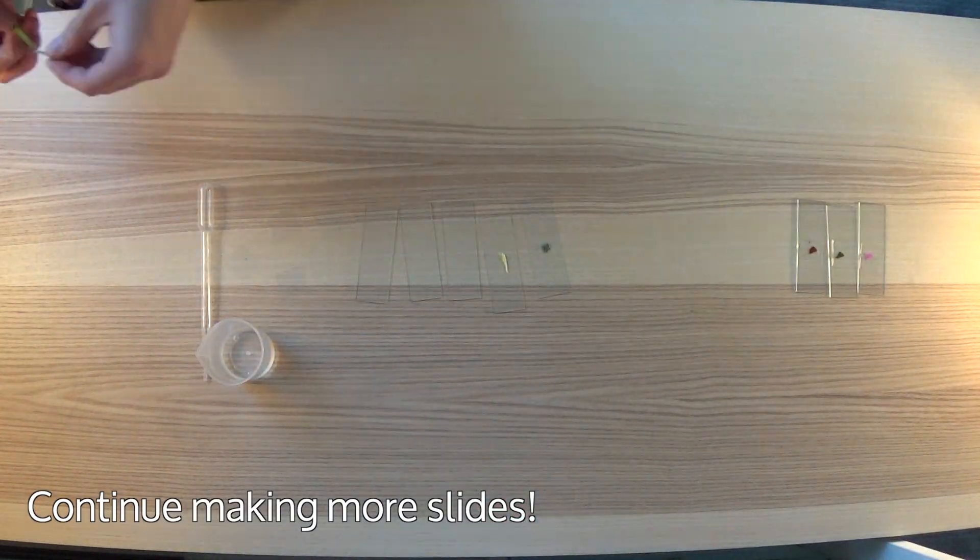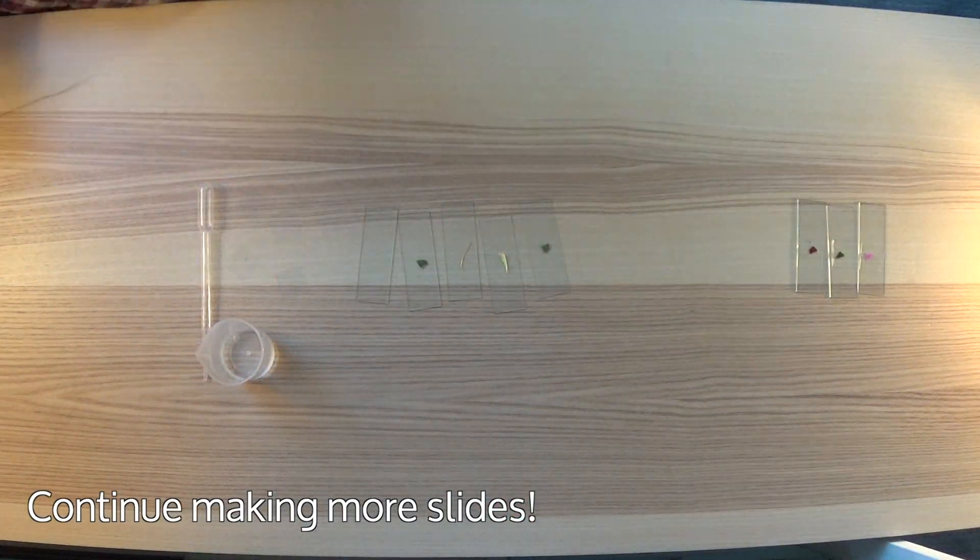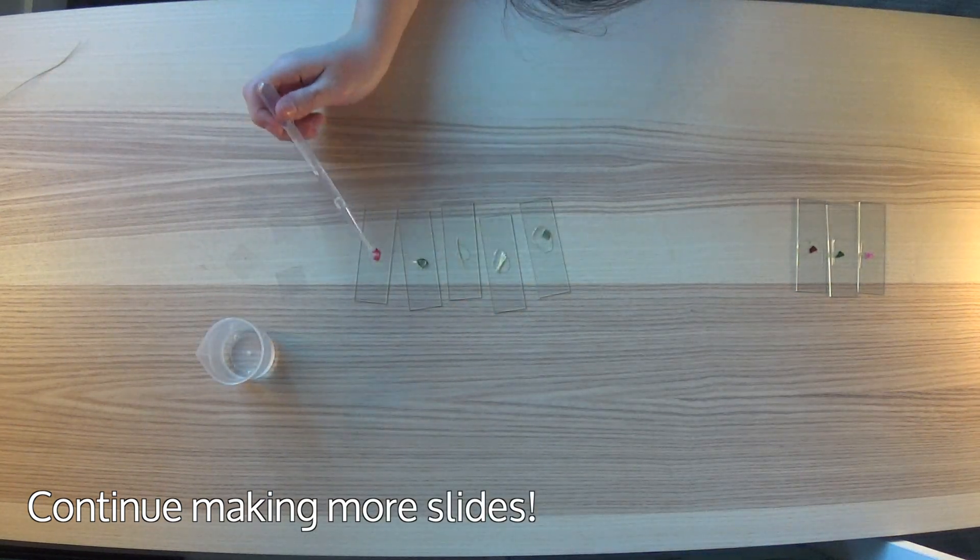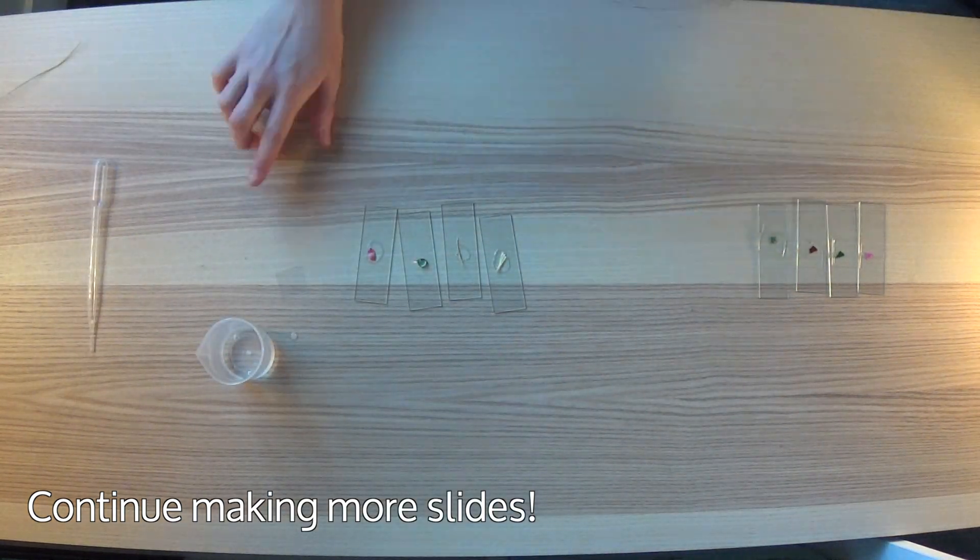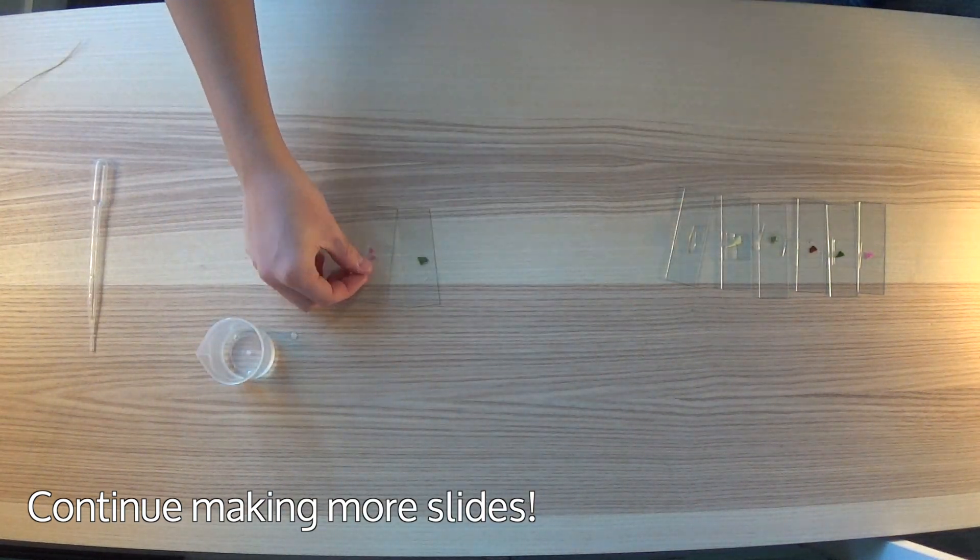Continue making more slides with different kinds of samples. Be sure to cut the samples really thin so that the light from the microscope can shine through.